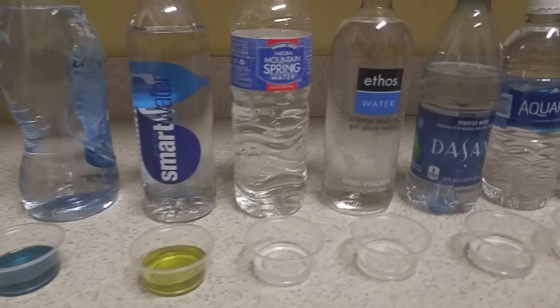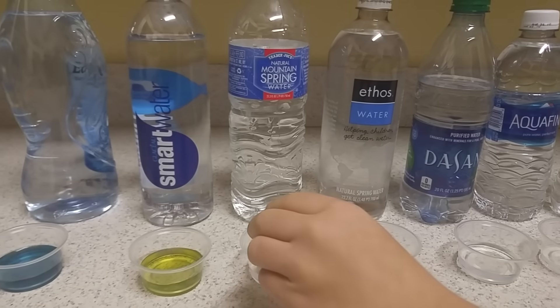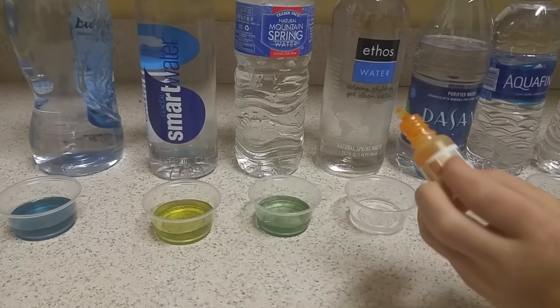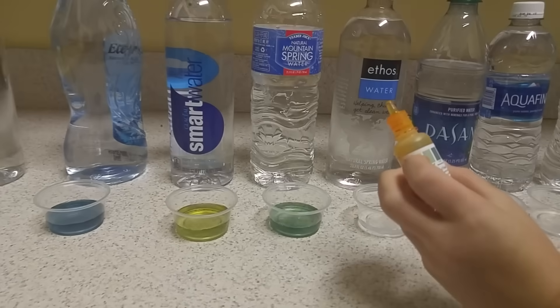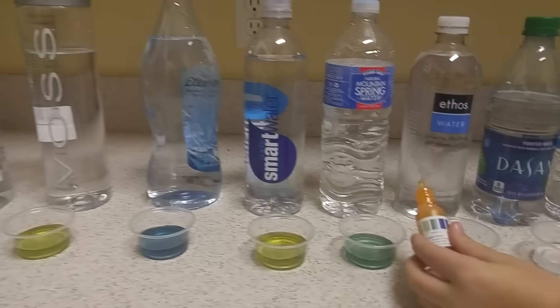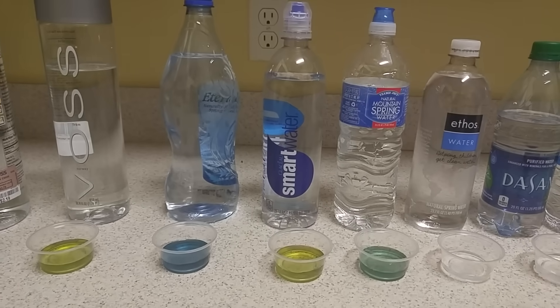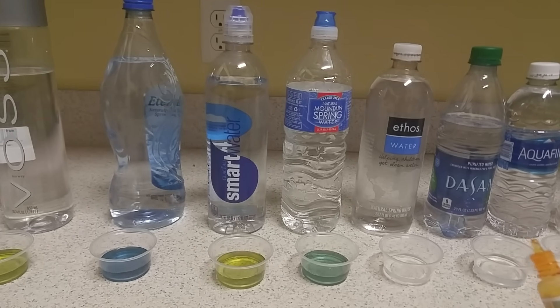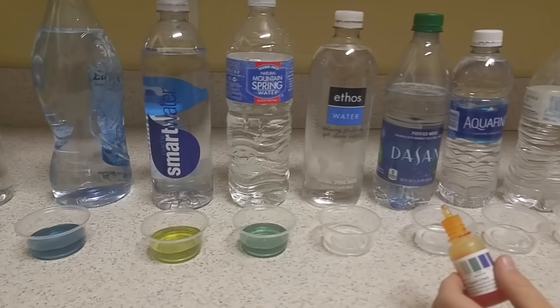Trader Joe's Natural Mountain Spring is probably a 7 — neutral. That's not bad. Considering Trader Joe's has a brand they specifically advertise as alkaline water with electrolytes, their natural spring water is at least neutral.